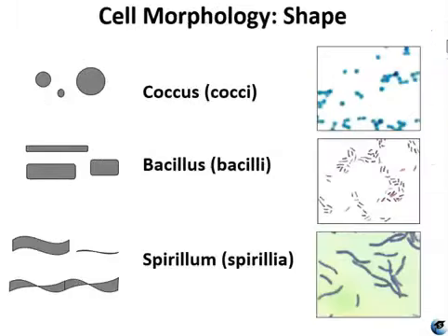It is important to learn what cell morphologies are, and make sure that you are aware that cell morphologies are very different from colony morphologies. Colony morphology is what we've seen in labs 1 and 2, where you're describing how a colony of genetically identical cells have all aggregated to form a mound of cells that you can view with the naked eye.